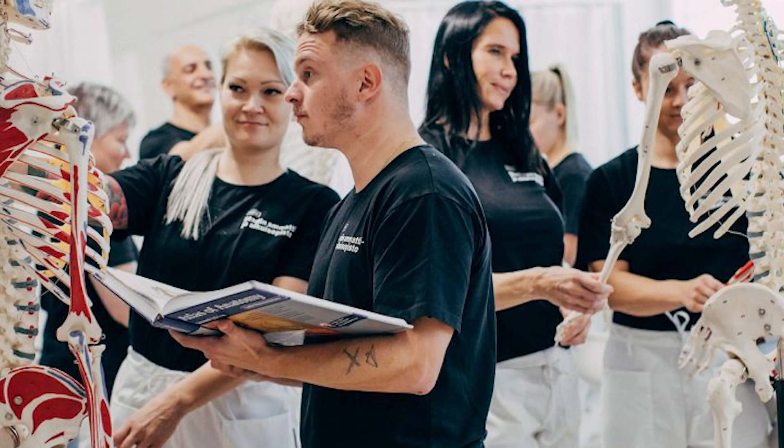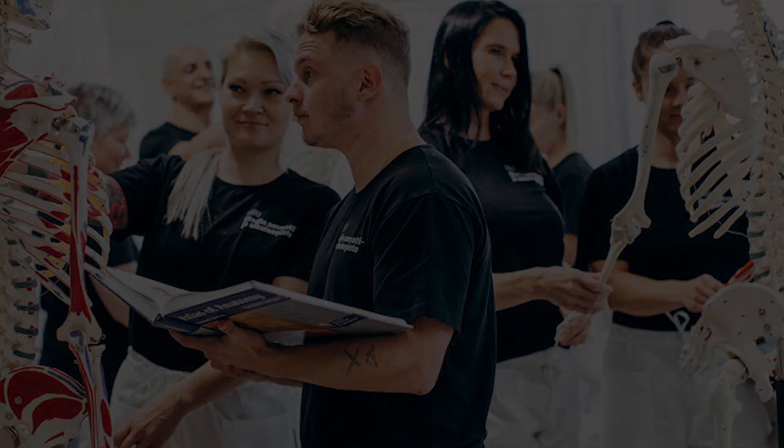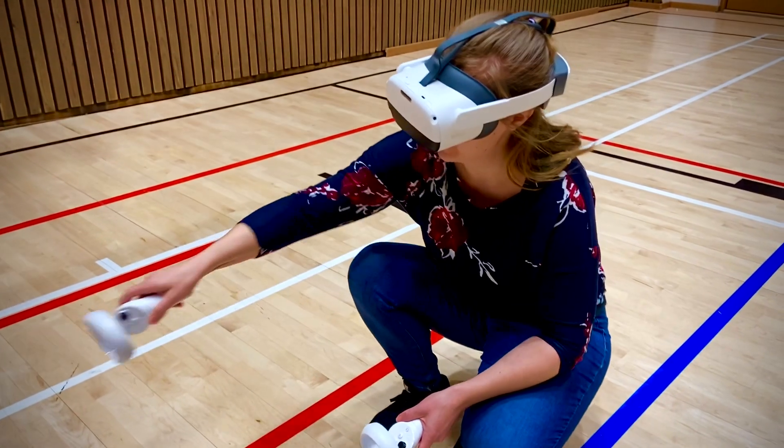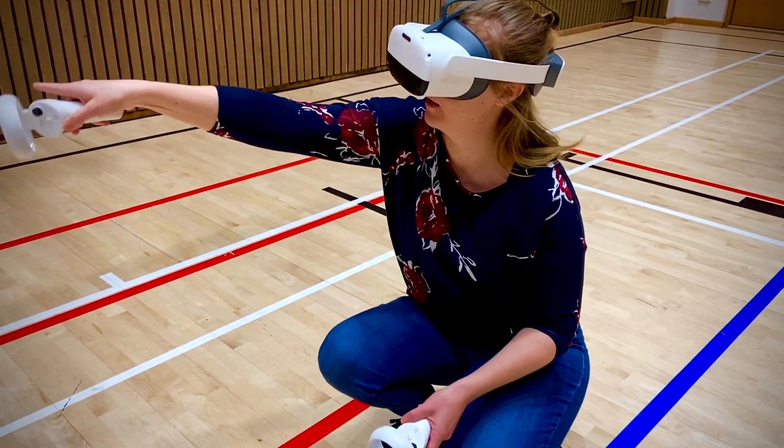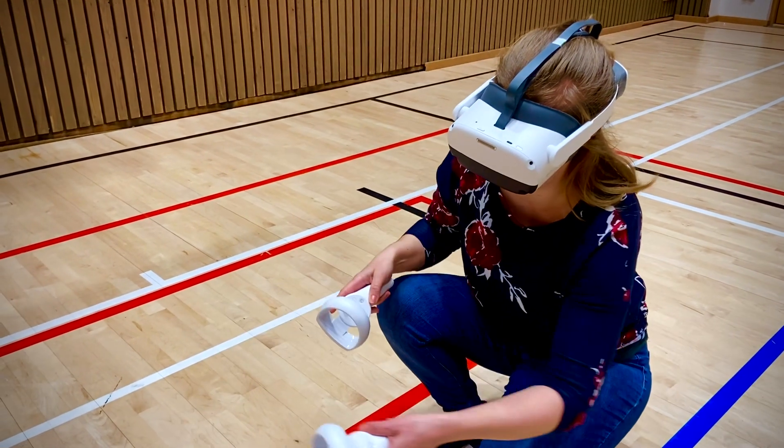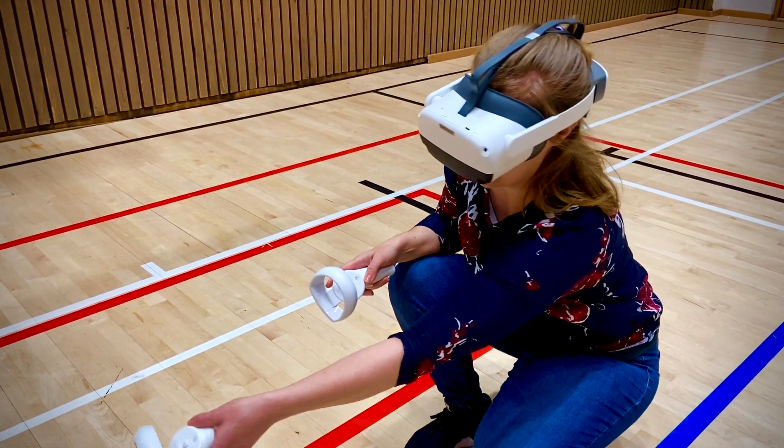Each study unit is assessed independently in real working life situations. As part of their educational portfolio, they have introduced VR learning solutions.